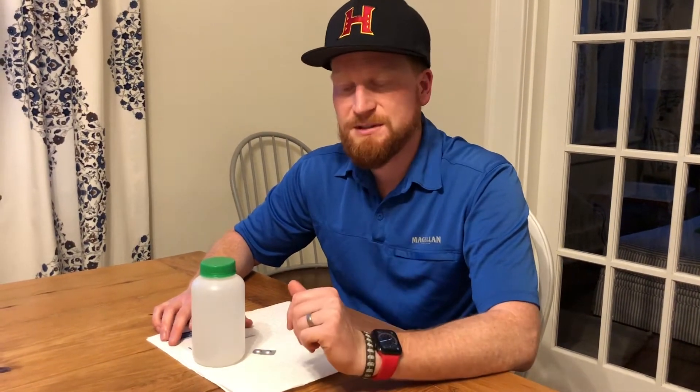Anyway, I'm gonna fill up these bottles and show you how to take a dissolved oxygen measurement. I had to come back to the house because I was losing the light at the creek, but I want to show you how to do the dissolved oxygen test because there's a little bit more skill involved with it.